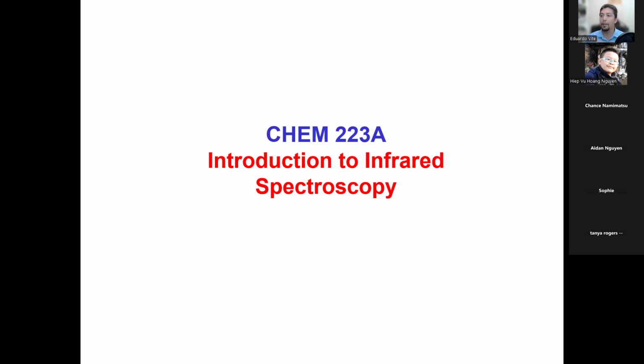We're going to talk about infrared spectroscopy. What is infrared? What is spectroscopy? What can we actually learn from this? Last week, I took you guys into the hallway and I showed you the machine. I showed you the graph and I told you about the dances, the molecular dances and the yogas and the vibrations. So we're going to get into the details of that today. So let's go ahead and get right to it.